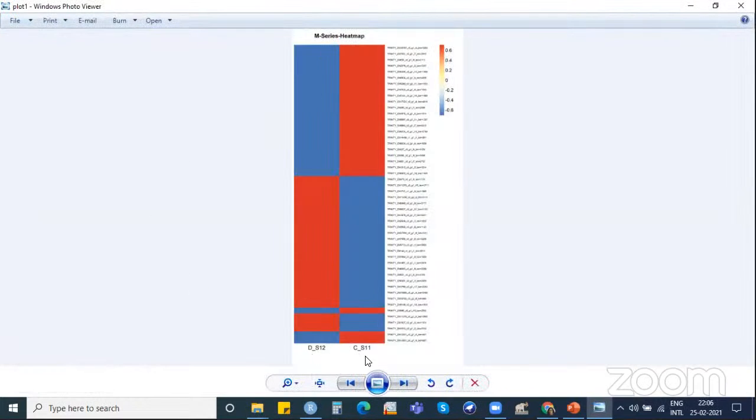You will have the sample, you have the control. Here all the genes will be listed and you can see how they differ between control versus sample. You can see these particular transcripts are upregulated in your control. They are downregulated in your control, and these are upregulated in the samples. And this particular set of genes is upregulated in the control sample, and these are downregulated in the samples.